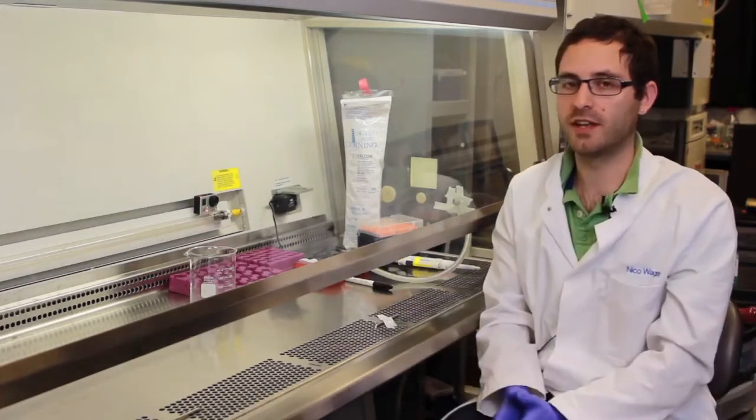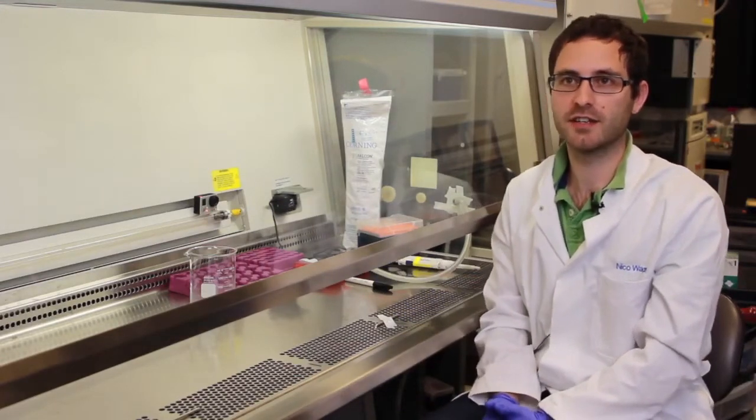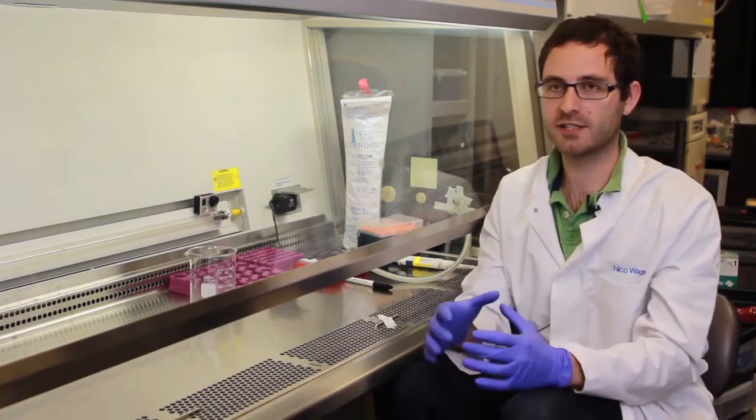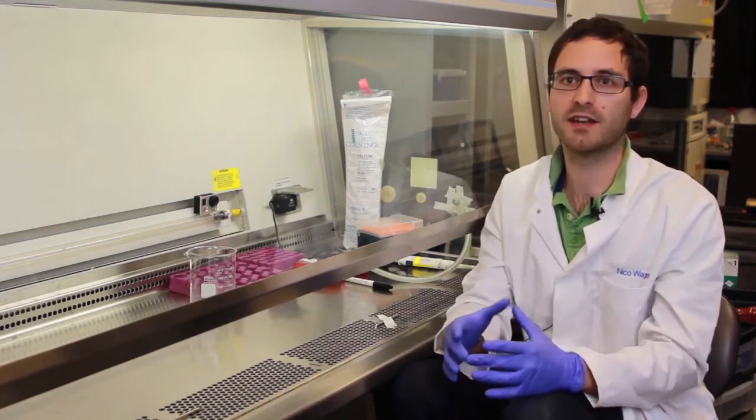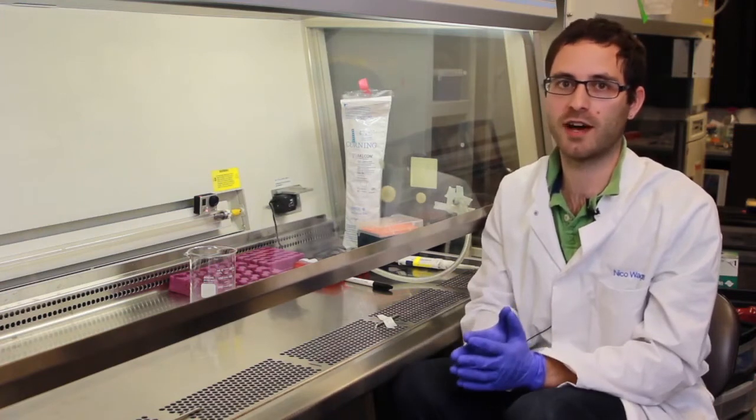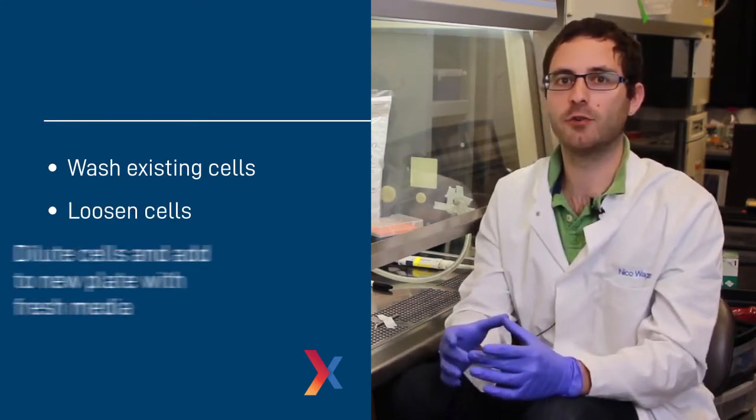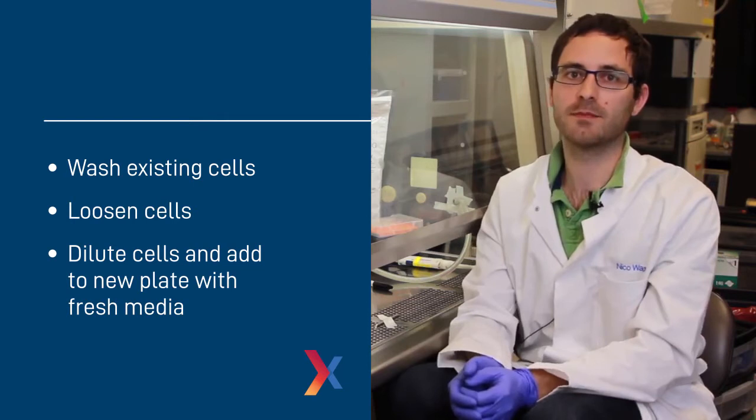What we'll be doing today is a basic cell passaging procedure. Cell passaging is important for taking your cells which keep on growing on the plate and diluting them so they don't overgrow and die. The quick overview of what happens is you wash the existing cells, loosen them from the plate, and dilute them onto a new plate in fresh medium.